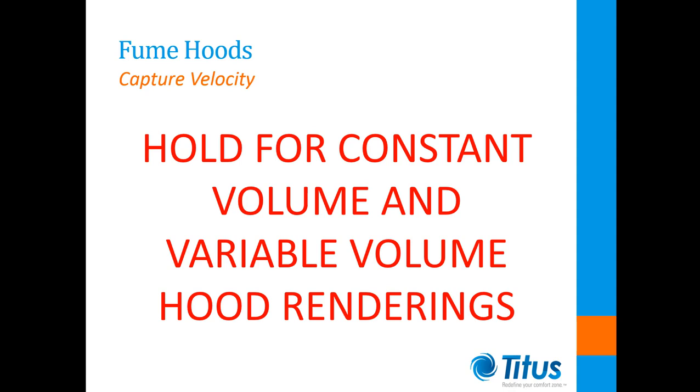There are two main types of fume hoods: constant volume hoods, also known as bypass hoods, since they maintain capture velocity with bypasses as the sash position changes. Then there are variable volume hoods that maintain their capture velocity by varying the exhaust airflow with sash position.